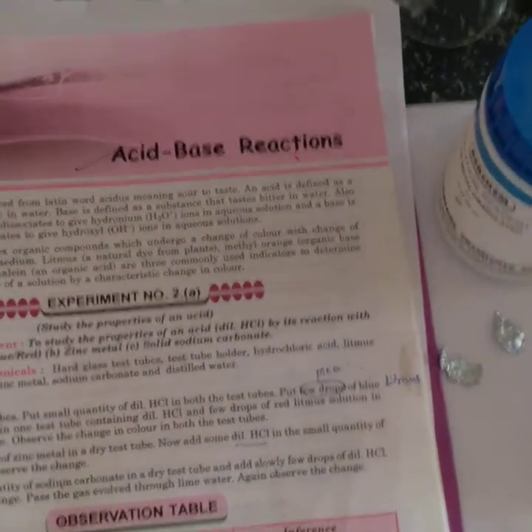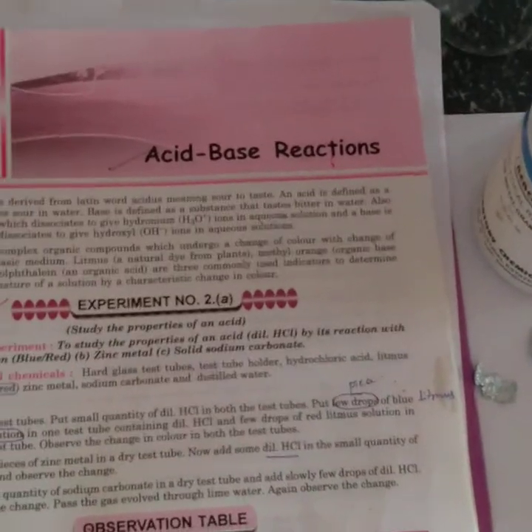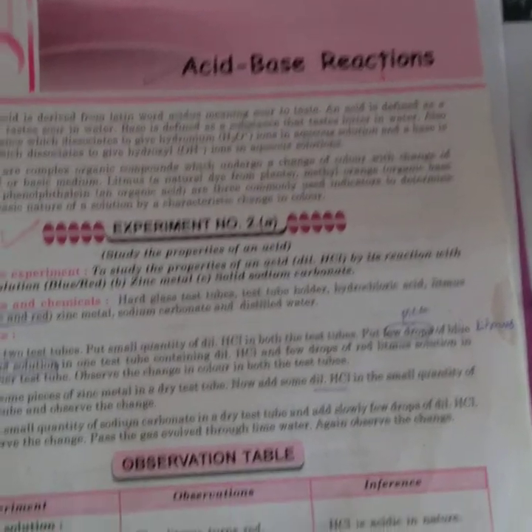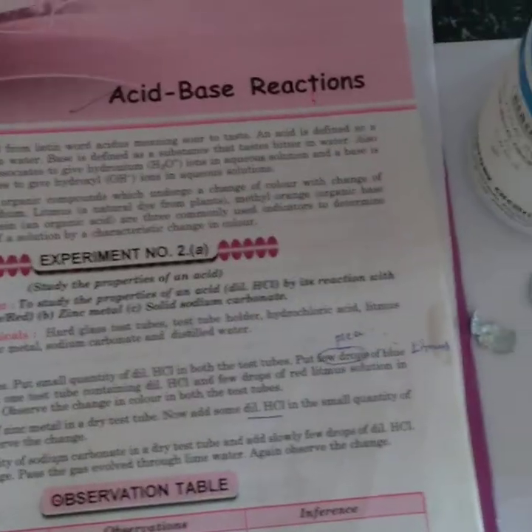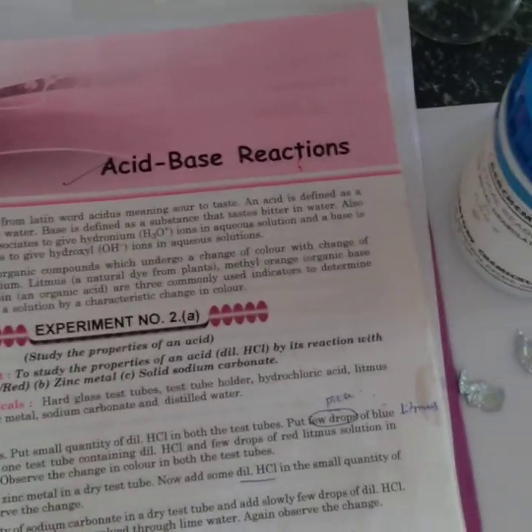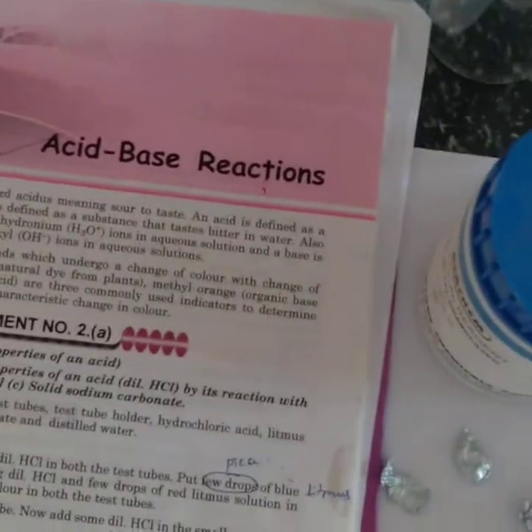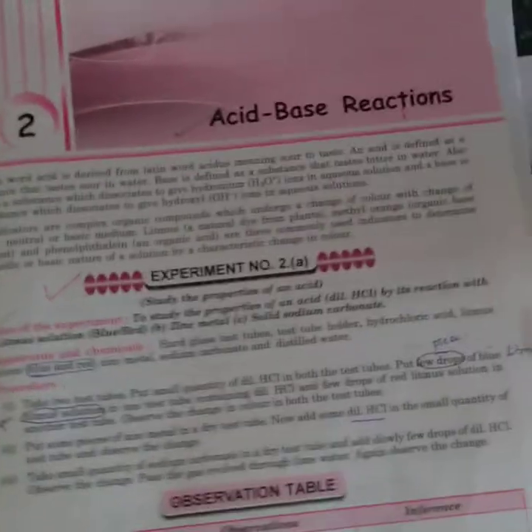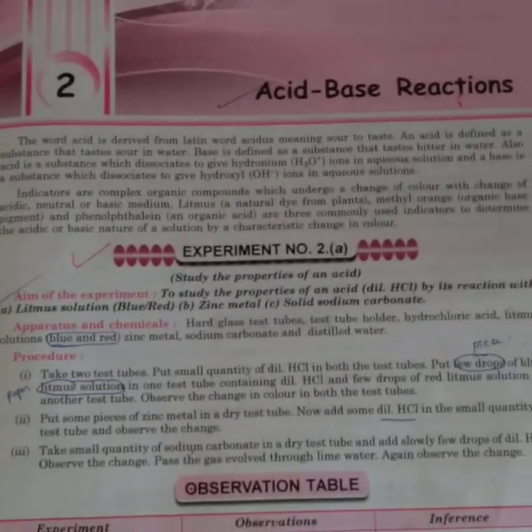That is what we call the observation. If blue changes to red, the solution is acidic in nature. So this is the litmus test. You can do the litmus test with litmus paper, and you can also use litmus solution. You will get the same result, that is, blue to red. So that is the litmus test.